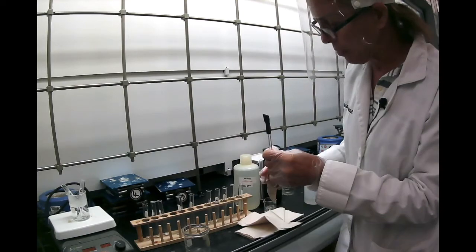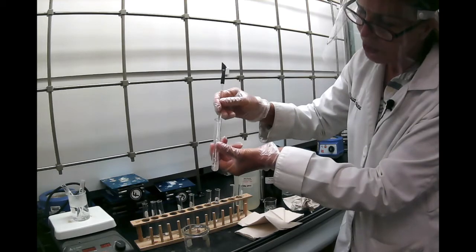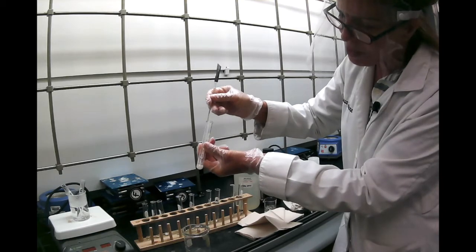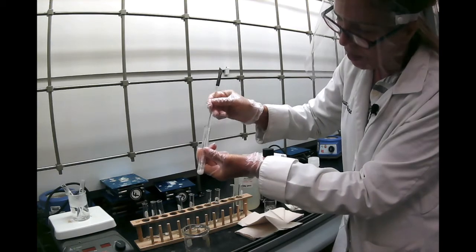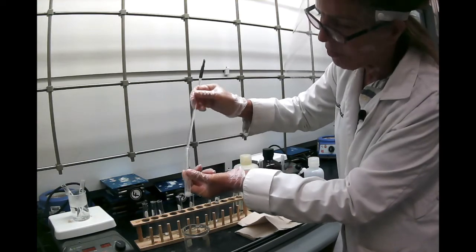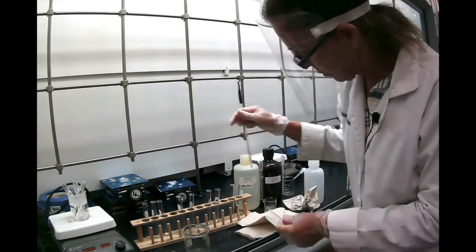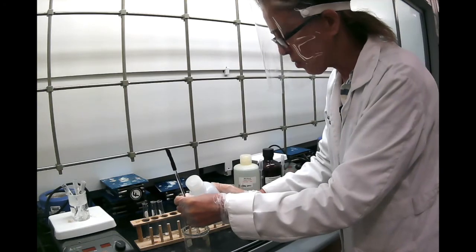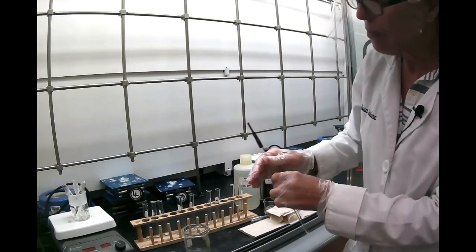Then the last sample is acetanilide right here. We're going to try to dissolve it the same way. It's obvious it doesn't look like it's dissolving. And if it doesn't dissolve, you put it in hot water and wait. So we're going to wait a little bit and stir again each of them in the hot water.